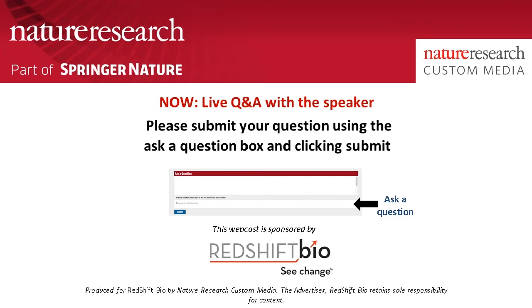I think I will take that question. So far, yes. As we test different kinds of proteins and peptides in different formulation buffers, we did not encounter buffer excipients interfering with our signal. All the common excipients used in the industry, we don't have any problem measuring samples in that buffer.